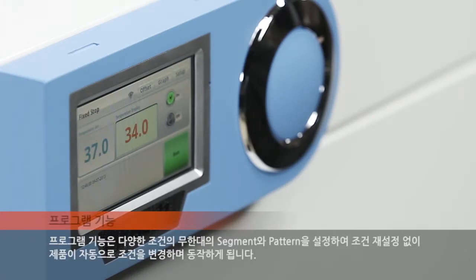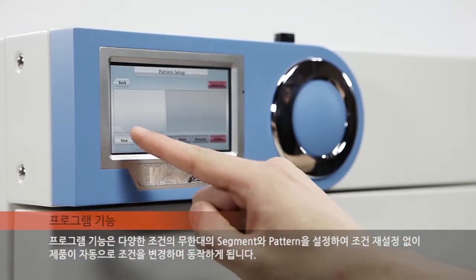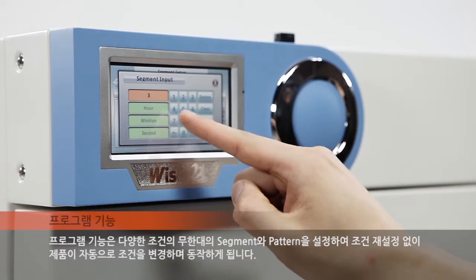The program function enables setting of multiple segments and patterns in various conditions, resulting in automatic condition changes of the unit without the need for resetting conditions.